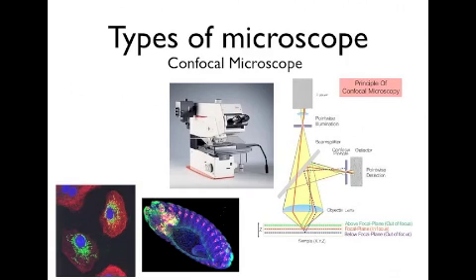And it also allows for multi-labeling. So in this first picture, we have several cells and nuclei, and we can see that what is stained in blue is the nuclei. The cytoplasm is in red, actually the cytoskeleton, and the green dots are ribosomes, I'm pretty sure. So as you can see, you can tell different parts of an organism.